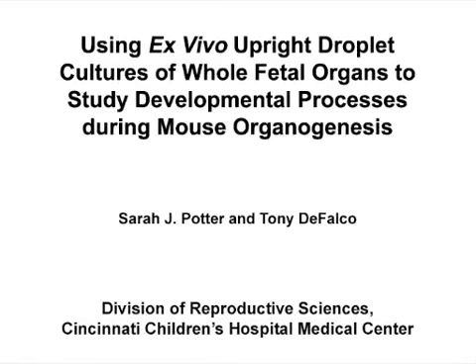The overall goal of this procedure is to examine the effects of small molecule inhibitors on fetal organ development using an ex vivo droplet culture technique.